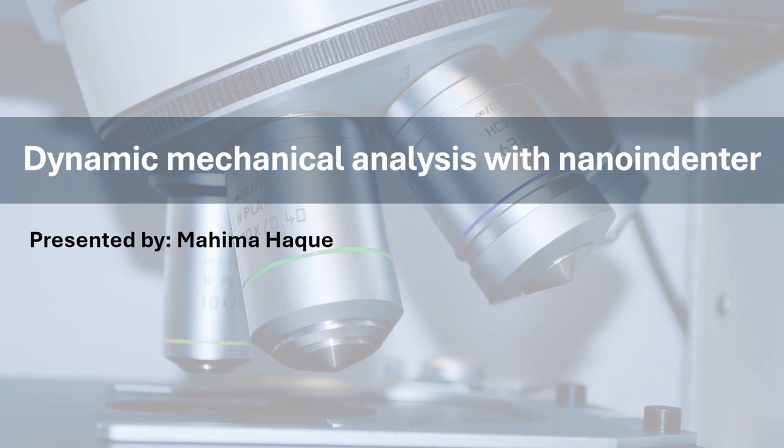Hi, today I will talk about dynamic mechanical analysis with Nanoindenter. At first, I'll give a brief introduction about what dynamic mechanical analysis, or in short DMA, is. I'll talk briefly about nanoindentation and why both of these techniques can be combined together to characterize material properties.